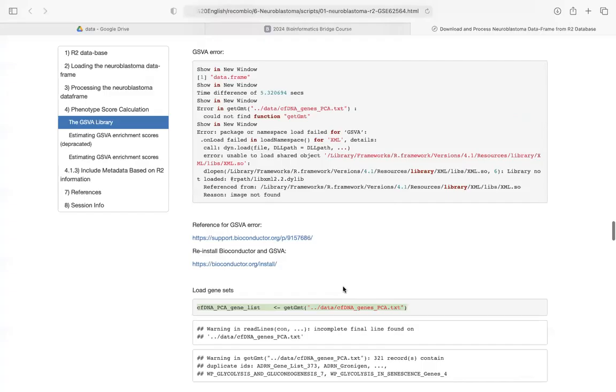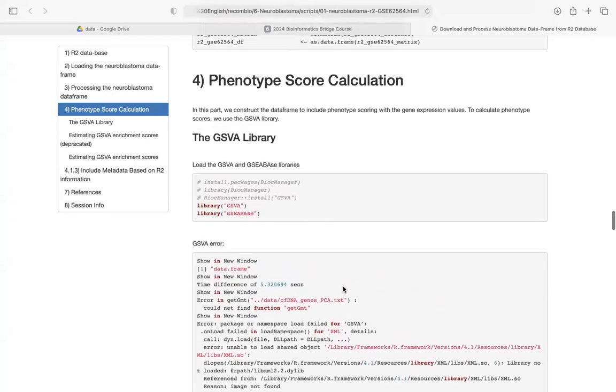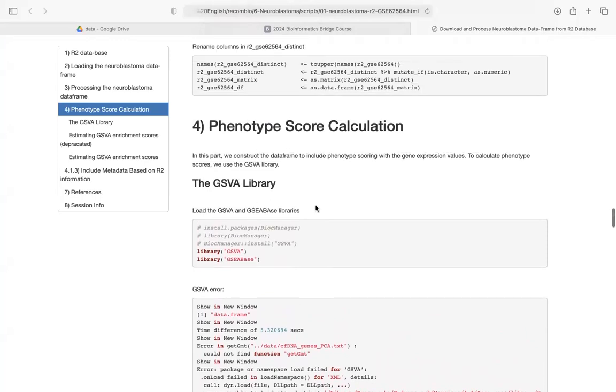So one way that you can understand this part is imagining that we need to access the expression of phenotypes in the tumors. And one way that we have to access those values is by calculating how much of certain phenotypes we have in the tumor.